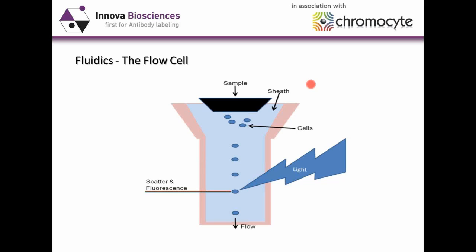That is typically called hydrodynamic focusing, and so the systems are in place to convert a cell suspension into a stream of single cells which can be analyzed independently. That could be the fluid system which generates that, but some instruments these days can now focus the cells or produce a single cell stream using acoustic techniques.